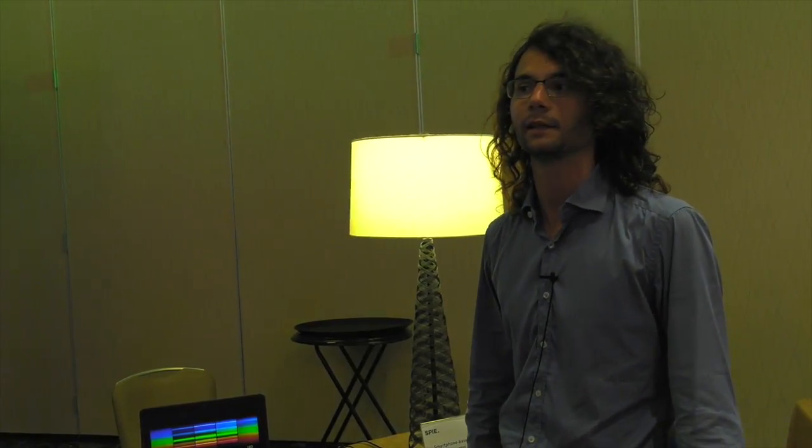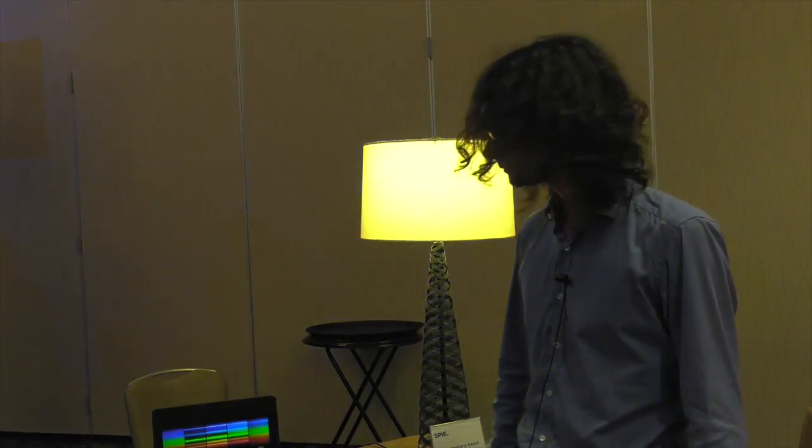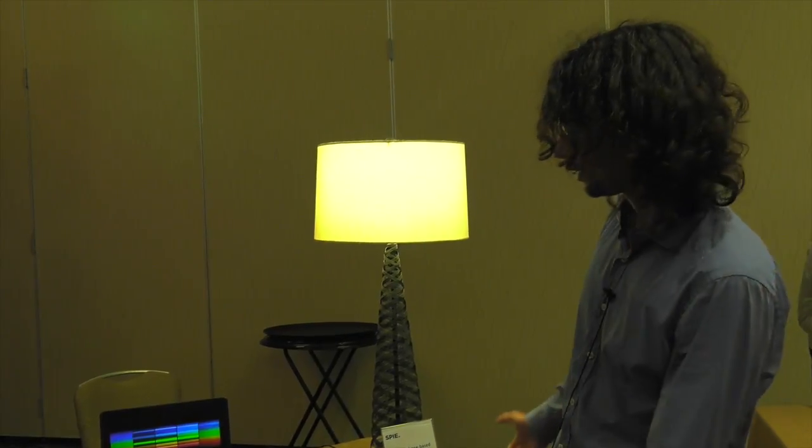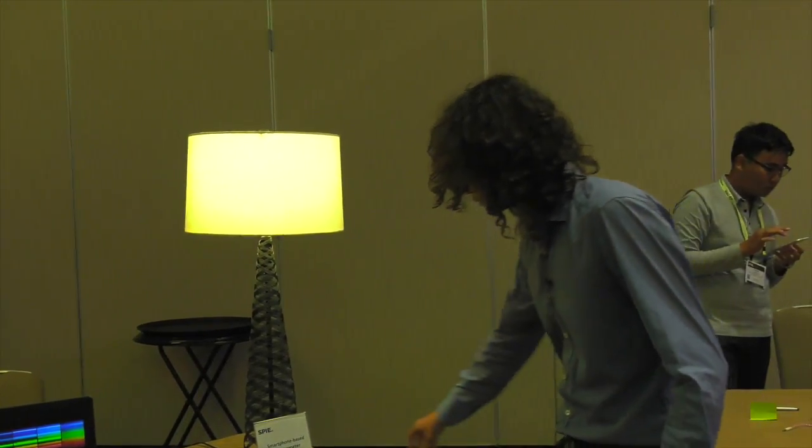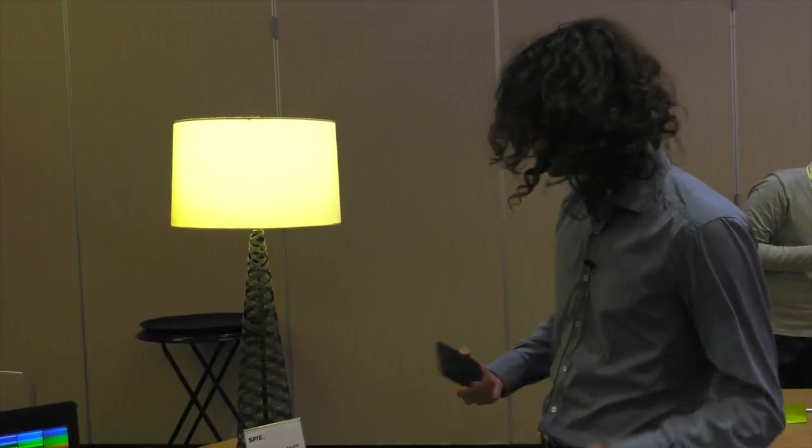Hello everyone, I am Damiano Verardo. I am Italian but I represent the Lund University chapter in Sweden and our outreach is about how we can turn a normal smartphone into a spectrometer.